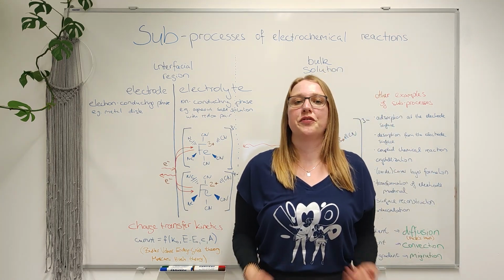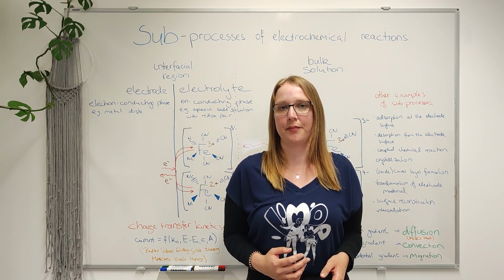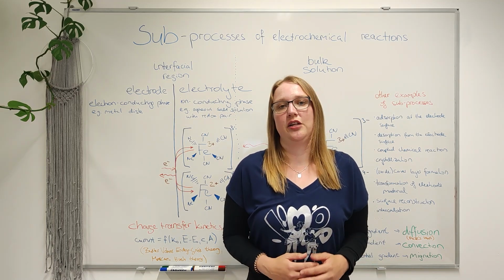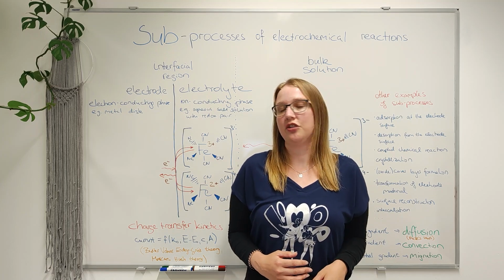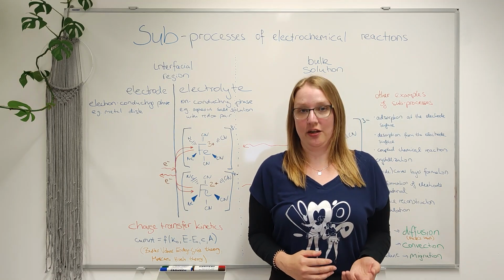In EIS, the corresponding quantities available to us are called charge transfer resistances. They are ohmic in nature, but are potential dependent. As we apply a more negative potential to the electrode, a cathodic net reaction occurs and current flows through the interface, so that the concentrations of ferri and ferrocyanide in front of the electrode change.